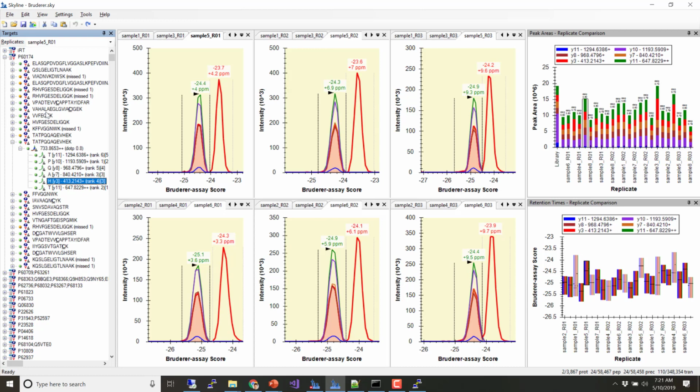I have seen very convincing presentations that have used that fact to say, hey, my knockdown was successful, right? I'm expecting this thing to go away, and I prove it because it's no longer next to this other thing. And that can make it a little cheaper to prove than ordering a synthetic peptide. The other way you can prove it is to order a synthetic peptide and then they should coelute exactly, and you can prove a knockdown that way. But you can also just prove it because of an interference. Imagine if you had another thing right here, and then if the thing in the middle goes away, then yeah, I really got rid of it. Okay.